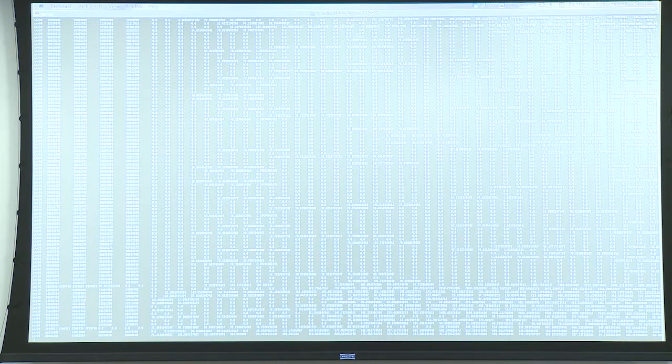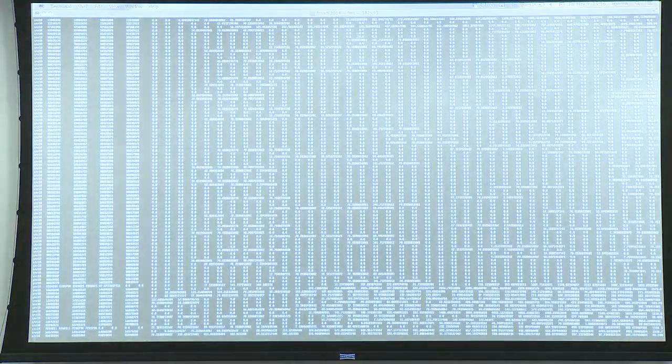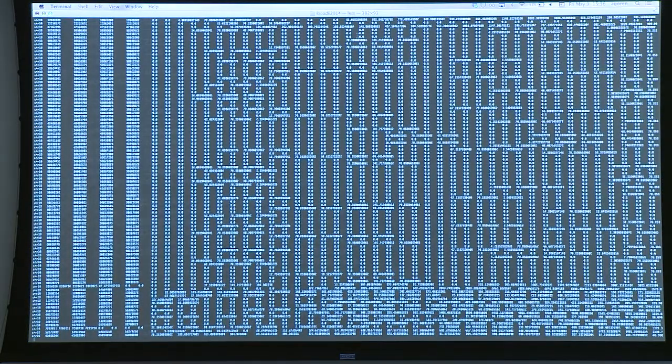So this, I hope, conveys to you a bit the way the file is organized while we're waiting for the other stuff to run. So this is going to say chromosome 19. I've made it smaller because it goes on for a long while. It's going to be chromosome 19, chromosome start, chromosome end.